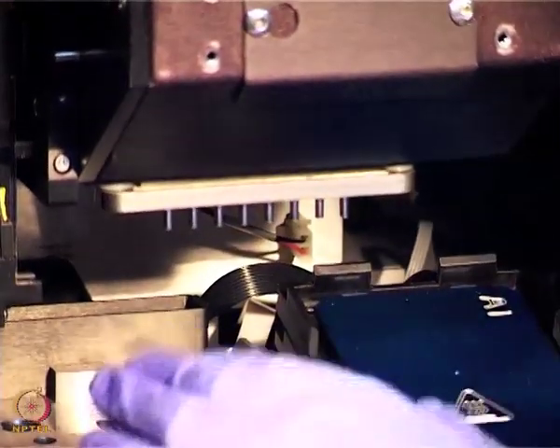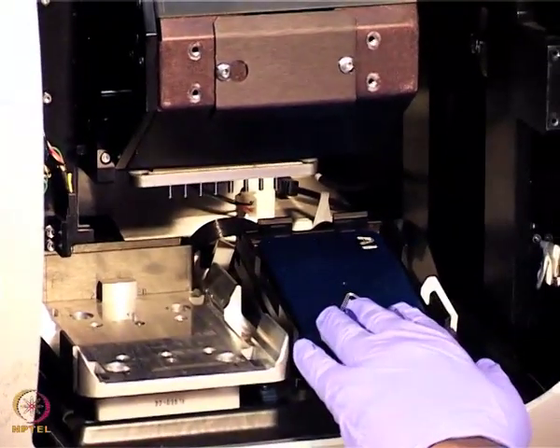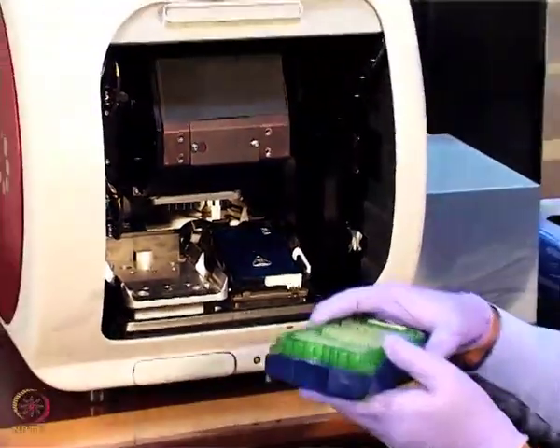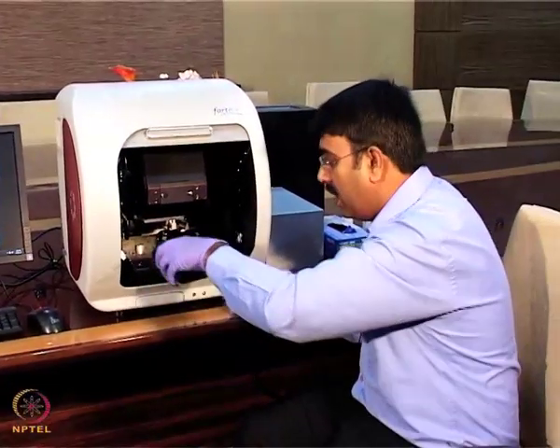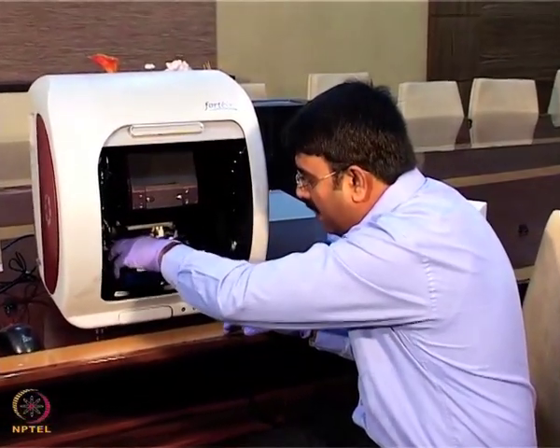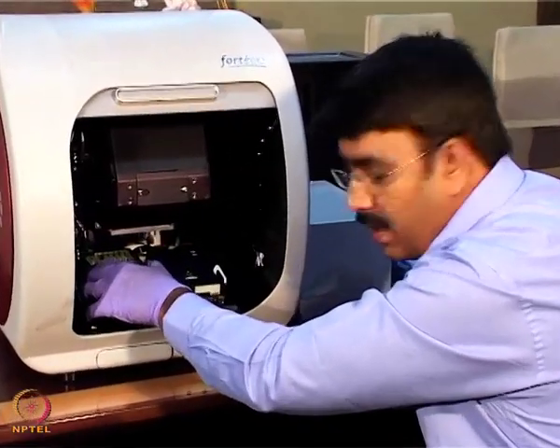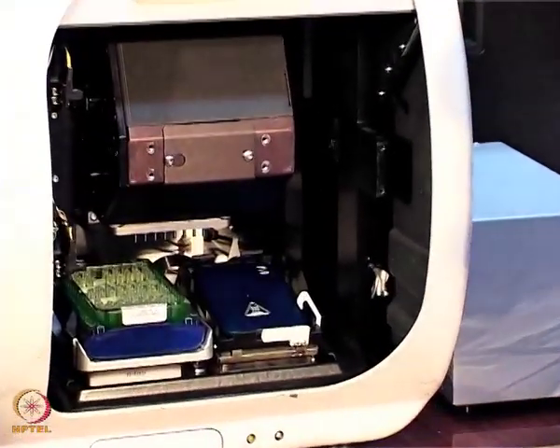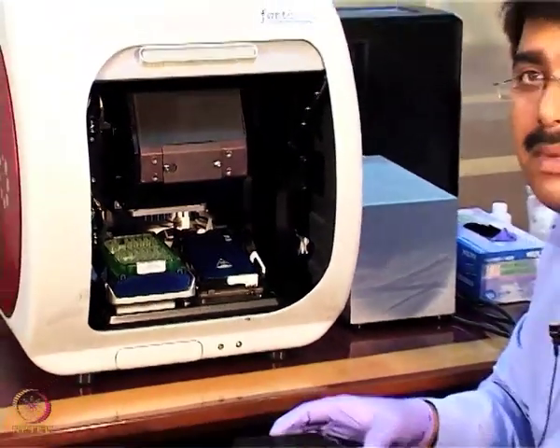Here, this is the sensor compartment, and this is what we call the sample compartment. Now you can see this is what we call a sensor holder, or sensor manifold. Here we can put the sensor in this fashion, and then we can put this as a sample. This is the 96-well plate format, so we can analyze 96 samples in one go.